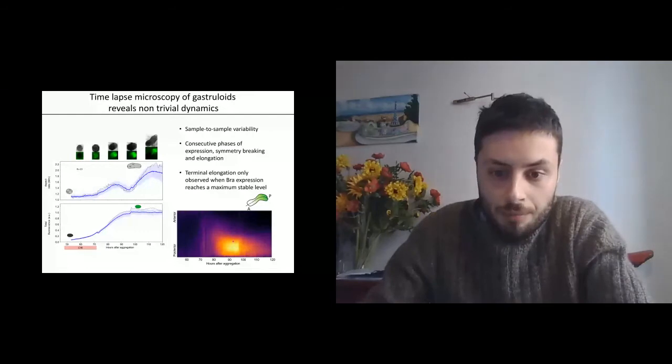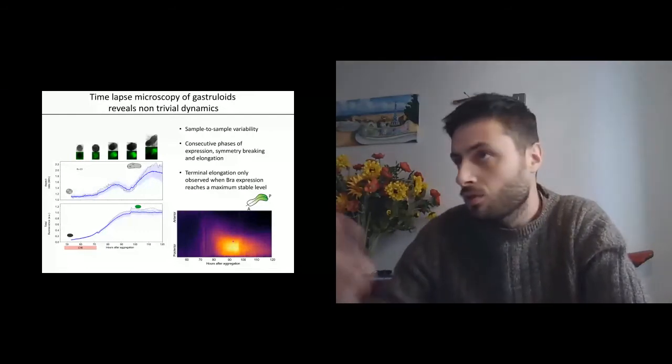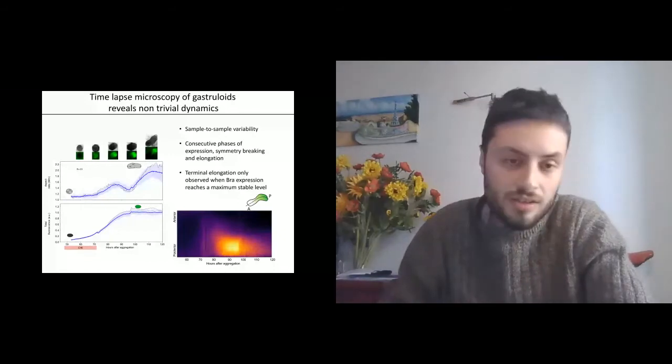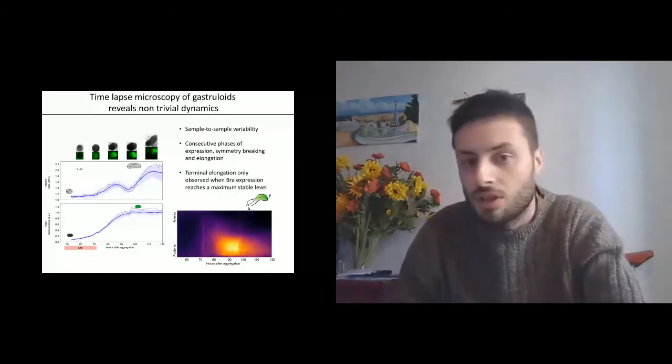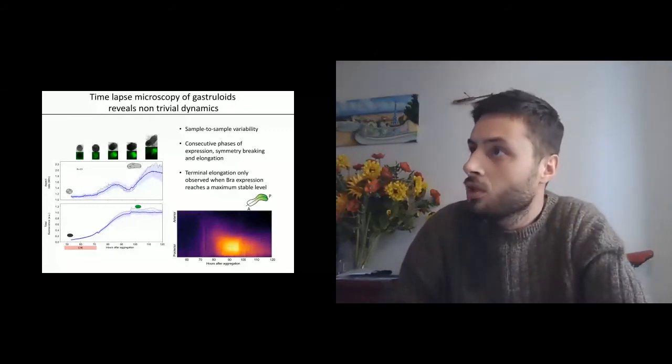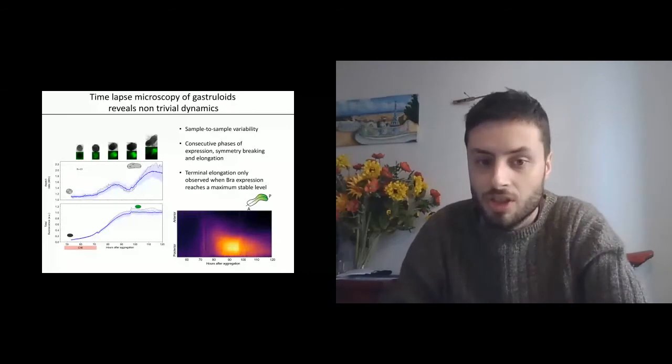So what I focused on so far is present and very well established high content screening assays. What I would like to do in the last few minutes of the presentation is to move towards high content, high resolution imaging.